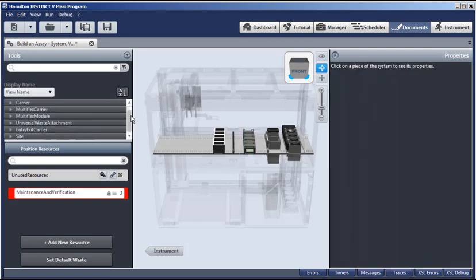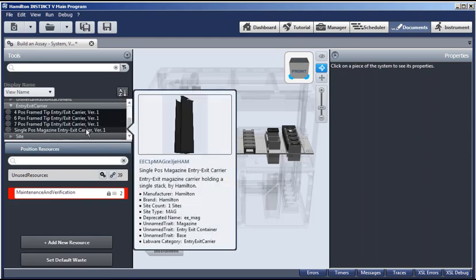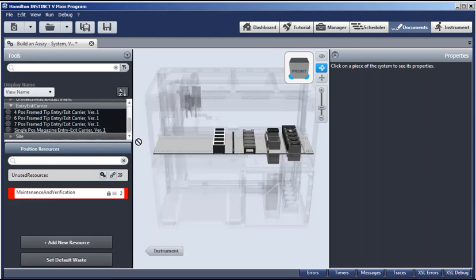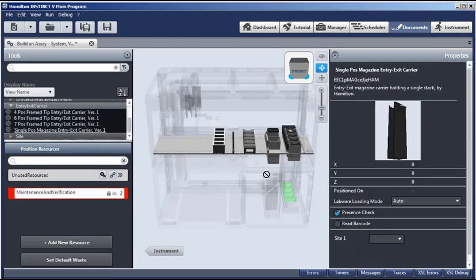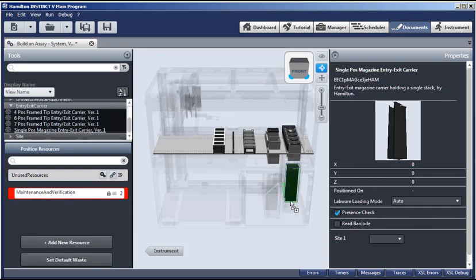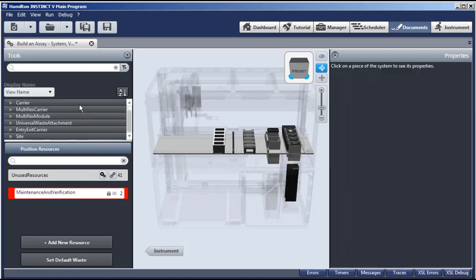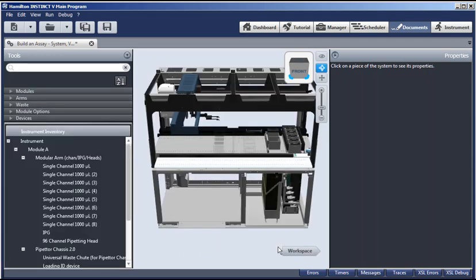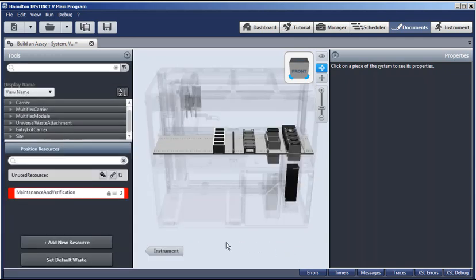And if you use an entry exit, you'll need at least one magazine. Select it. And then place it at the desired location. And this can be used to hold tips or plates. As you can see, select from the dropdown list and just drag and drop based on your assay needs. Now we have both the instrument configuration and the workspace configuration.